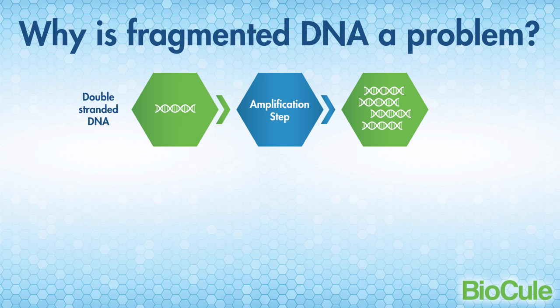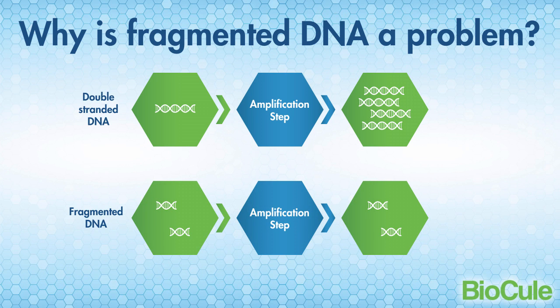While we won't be going into all the details of the many different ways low-quality DNA samples can cause problems, I'll give a couple of examples. The most common problem is fragmentation. Sample amplification is a typical step in most DNA processing applications. However, when DNA is highly fragmented, the amplification step usually fails. Similar problems would be seen with DNA that is nicked. These failure modes would either lead to no results or, worse, incorrect results that would be open to misinterpretation.